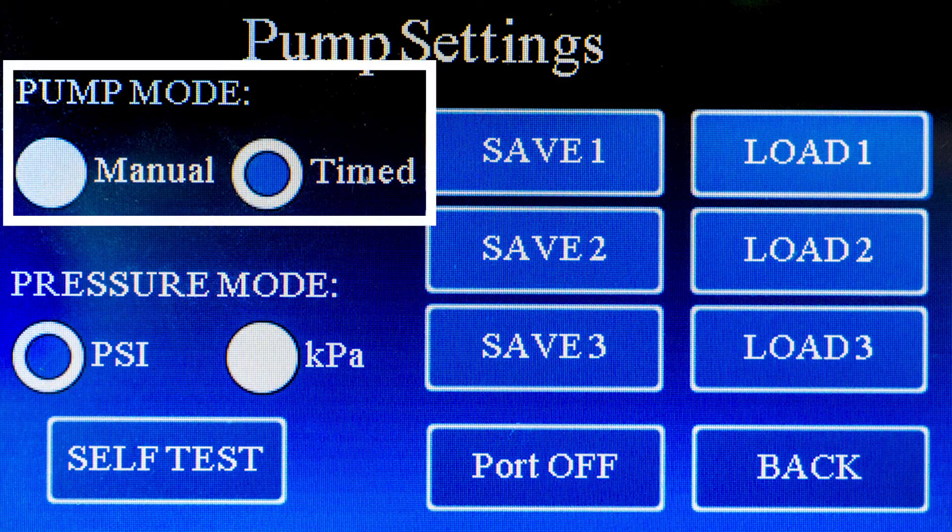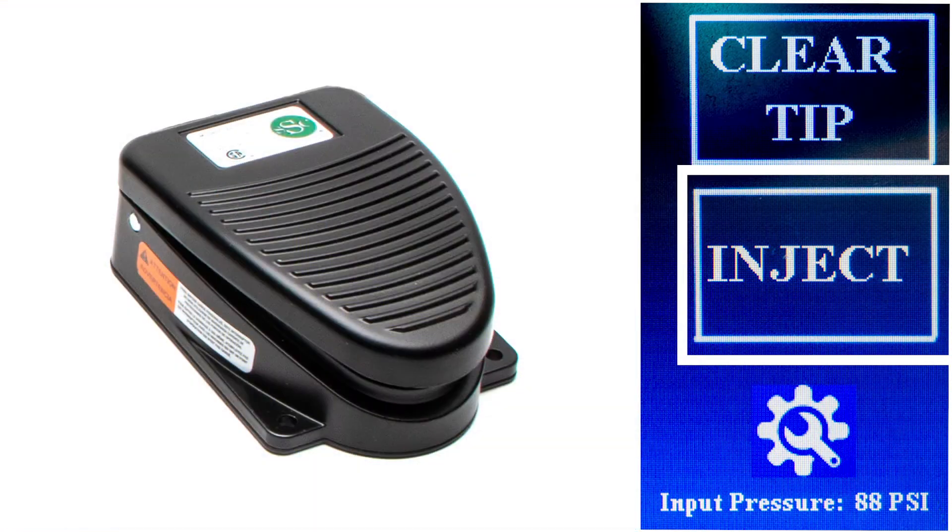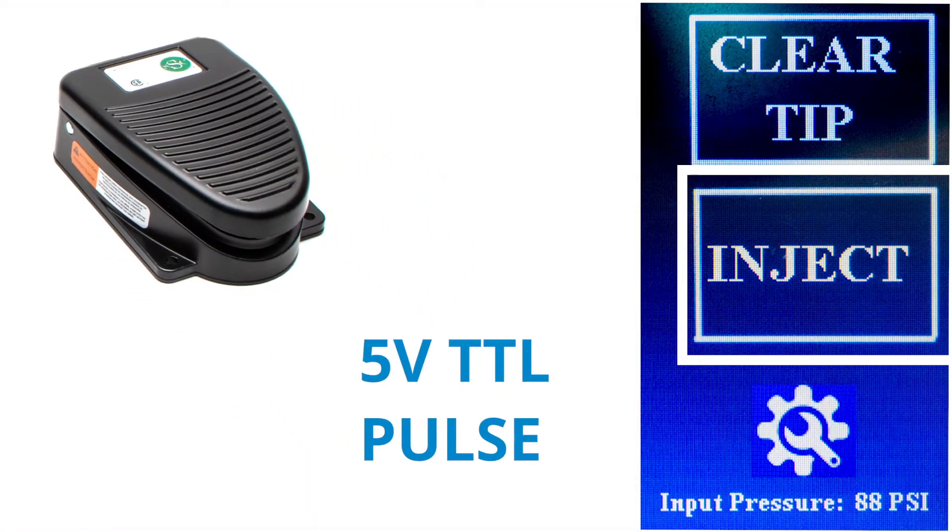The pump can be set to manual or timed mode as indicated here. In manual mode, the pressure valve opens and remains open as long as the injection button is pressed, the foot switch is pressed, or a 5 volt TTL pulse is triggered by an external pulse generator.